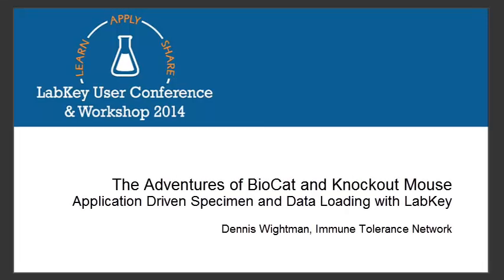Sorry. A little bit of background is we do clinical trials management. We're funded by NIH through NIAID and other organizations like the Type 1 Diabetes Foundation. And our mandate is basically to help the primary investigators and scientists put together their studies, do some of the analysis if they don't have that in-house with our biostats, especially help with the specimen management and everything. And so we chose LabKey a long time ago because it does both of those things. It can do your specimen management and your mechanistic data and so forth.